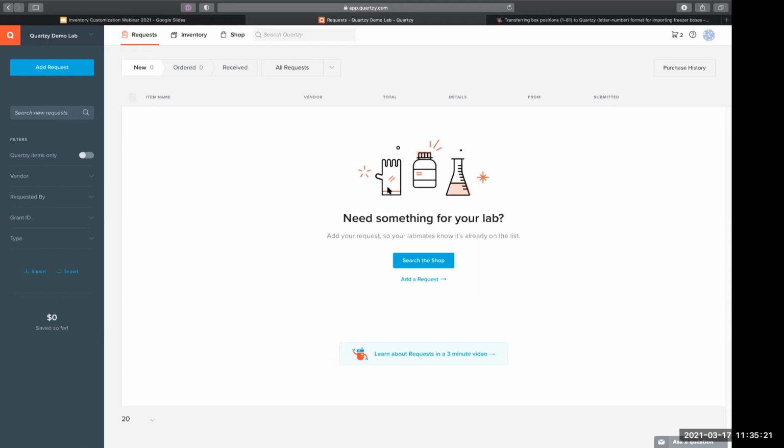So in terms of that, and also which is very much connected to the reordering process, you mentioned expiration dates that give you email reminders. I don't think that's useful either. In most cases, it's not about expiration. First of all, it's about when we run out of things, especially for high consumption rate items. So we can take that as an expiration date. Let's say that we're going to be out of this kind of consumable in a month or two, and then we can set that as the expiration date.